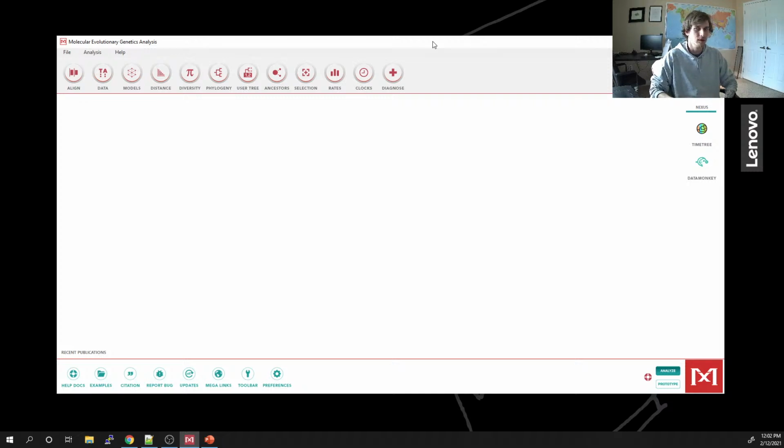Although, Mega is a great tool for phylogenetic analyses, especially for quickly exploring data. And certainly people publish studies using Mega, right? It's a no-joke piece of software. Although sometimes it's faster and more powerful to do things on a server with tools specifically designed for a certain problem. Mega is definitely a jack of all trades for molecular analyses, but if we want specifics, we might use a specific software that we would find on a Linux server.